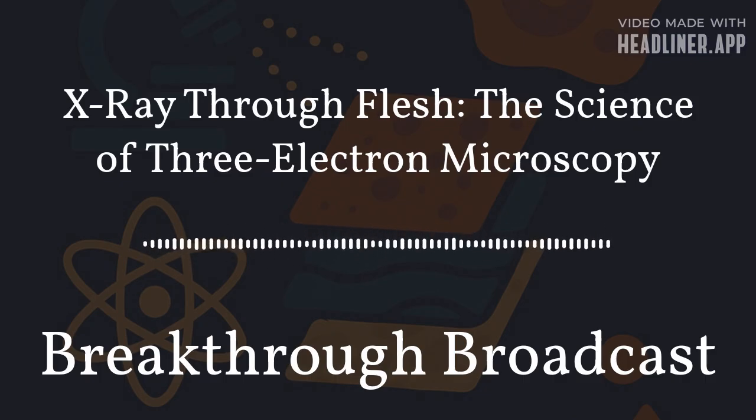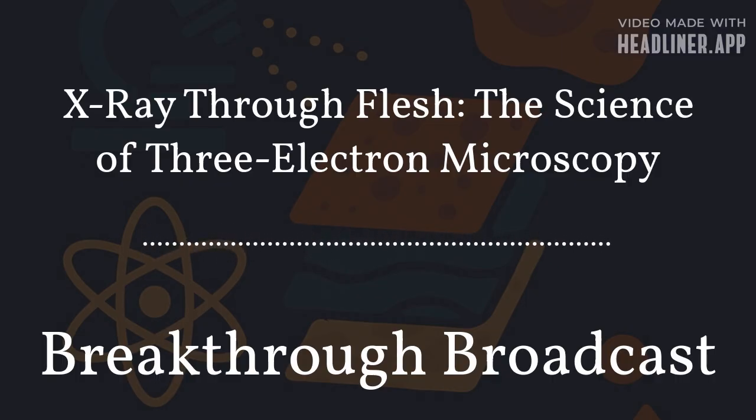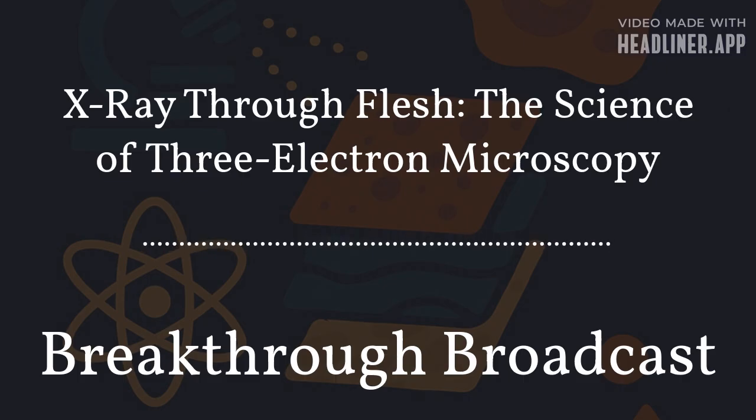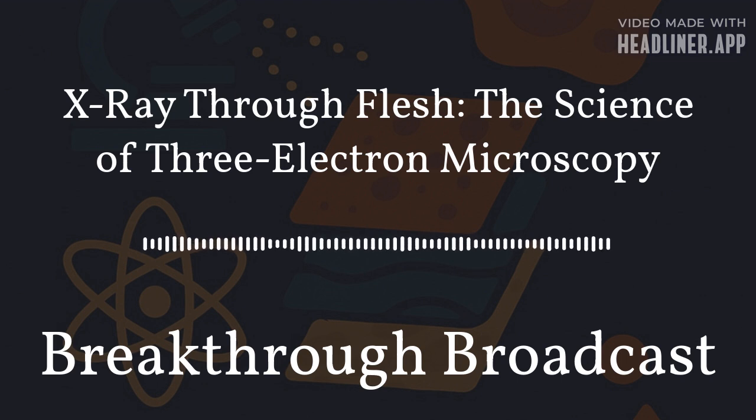Three-electron microscopy is still evolving, and many believe it represents the beginning of a new era in nanoscale imaging. Future versions may include faster detectors, which would allow scientists to watch chemical reactions or cellular processes as they happen. There's also interest in reducing the physical size of these instruments. While today's systems require large, specialized facilities, miniaturized versions could eventually fit on standard lab benches, making them accessible to far more schools and research groups.